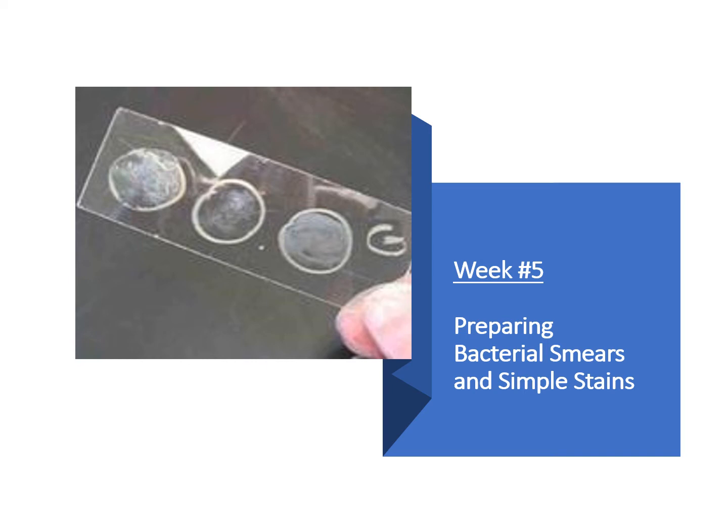Hello everyone. This week in lab we're going to talk about bacterial smears and we're also going to talk about simple stains. Later we're going to talk about different types of stains, but in this PowerPoint we're going to concentrate on talking about simple stains.